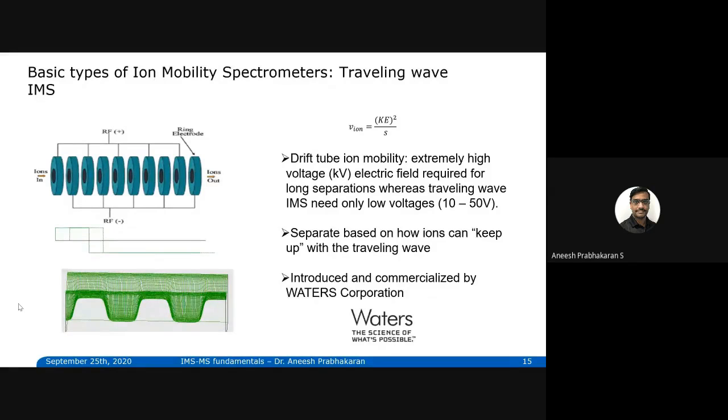If the device is that long, the ions stay in it for a longer time and start taking energy from the electric field, changing their size and shape. Then there is no point in analyzing the sample, because if the ions keep changing shape, it is impossible to analyze.